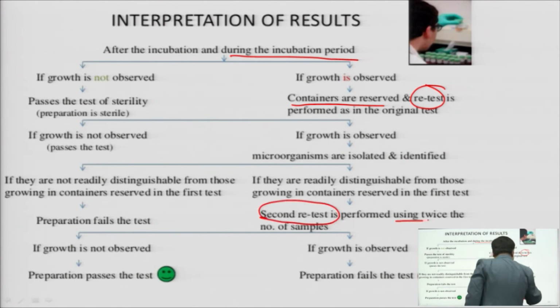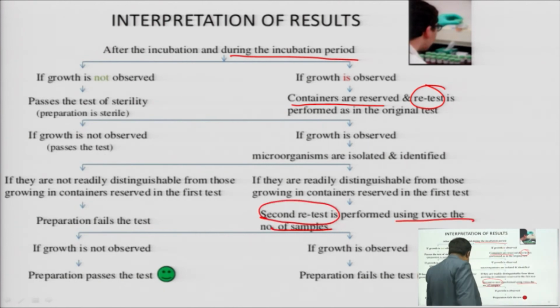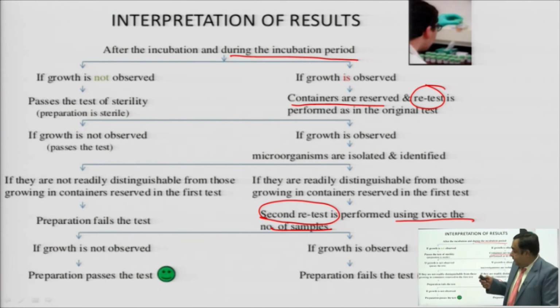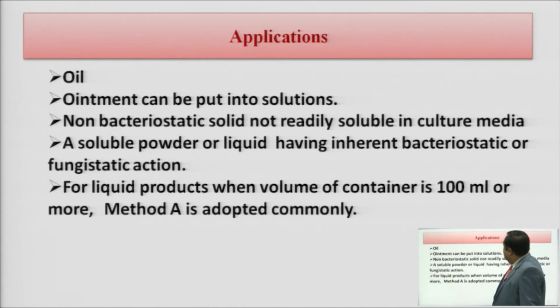Second retest is done using twice the number of samples. If there is no growth, the preparation passes. If there is growth, the preparation fails the test. Applications in oil, ointment, non-bacteriostatic solid, a soluble powder or liquid having inherent bacteriostatic or fungistatic action.